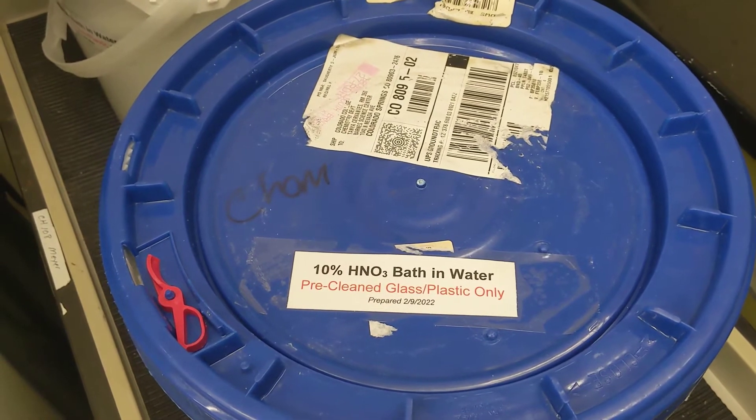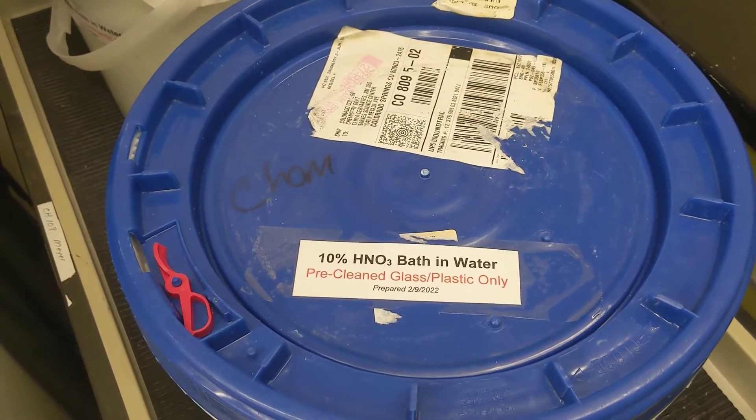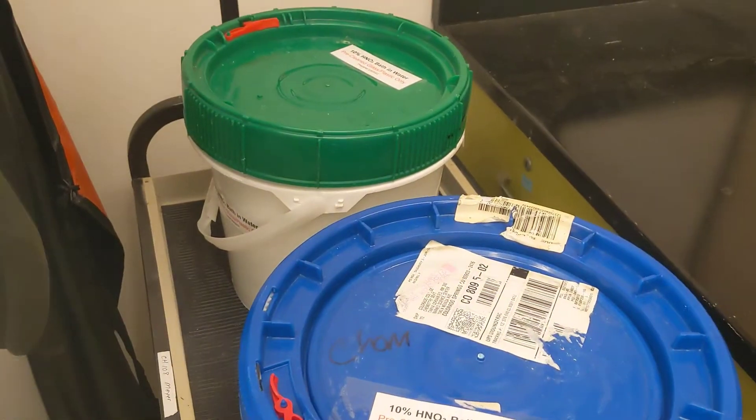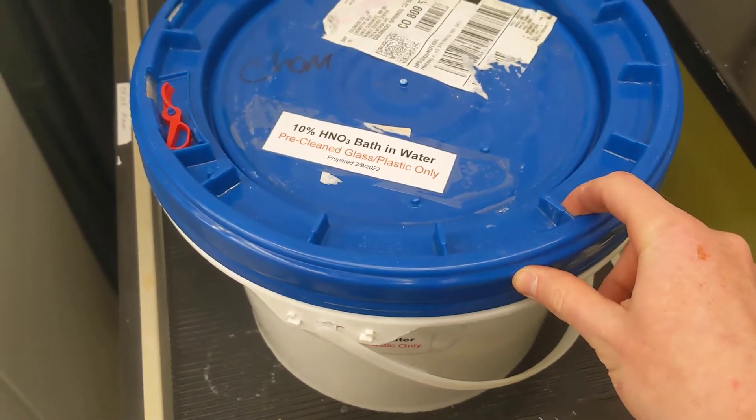You can only add plastic or glass to this for obvious reasons. If you add metal, you will dissolve the metal. Both of these should be completely sealed with an o-ring grommet to prevent evaporation.